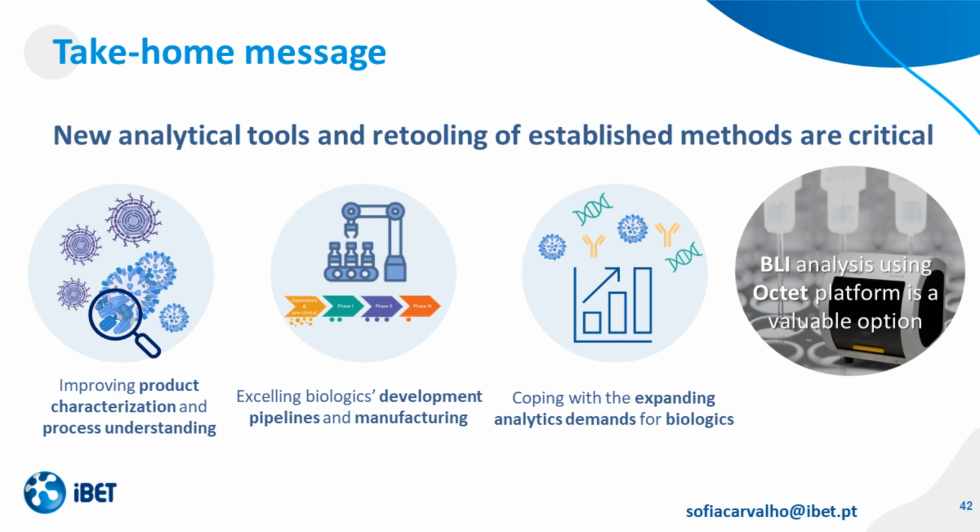And what are the advantages of antibody versus receptor binding, and when to choose one over the other?